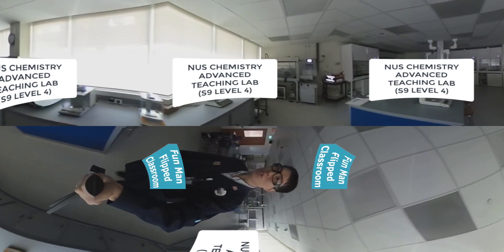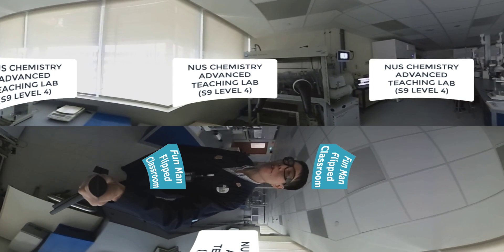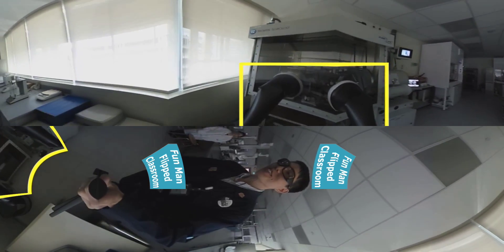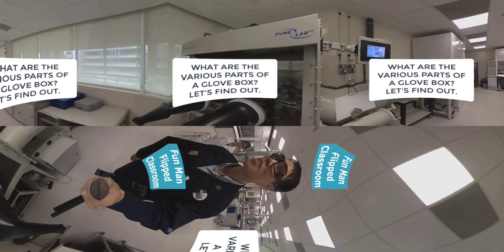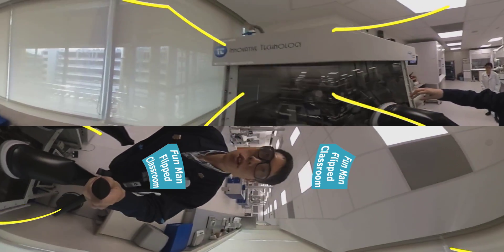Hi guys, I'm right now in the NUS chemistry advanced teaching lab here at S9 level 4. In front of me I see a pure lab HE glove box — you see a pair of gloves here. The lab is very dark; lights on please. Okay, much better. So now let's inspect what are the various parts in this glove box.